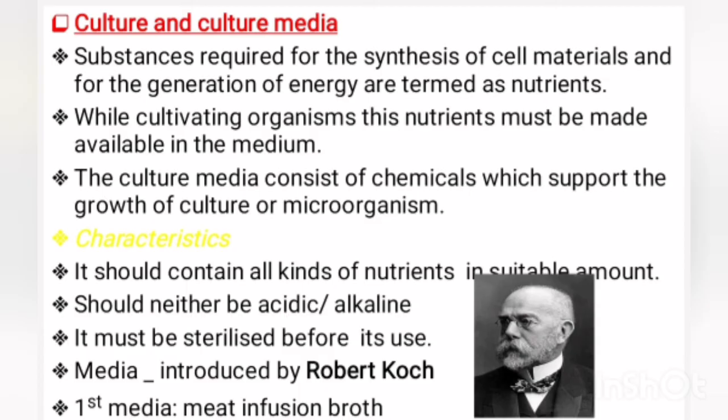Let's start with the definition of culture media and culture. A microorganism grown in a media is called culture. The culture media consists of chemicals which support the growth of culture or microorganism. Microbes can use these nutrients of the culture media as their food.